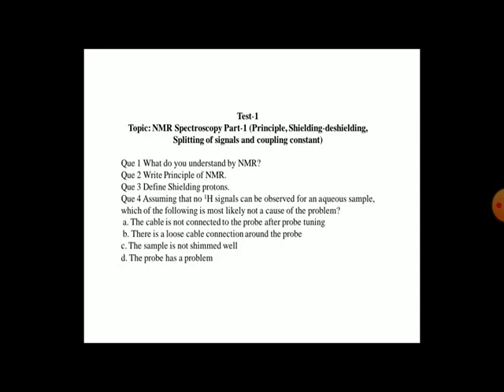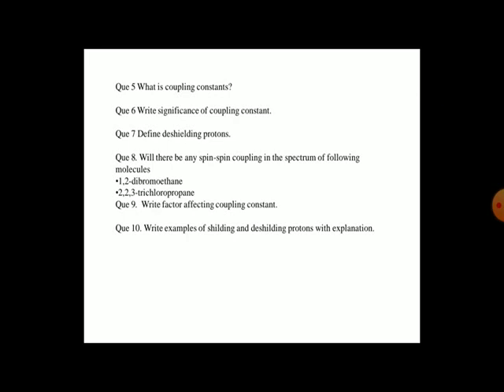Fourth question, assuming that no hydrogen signals can be observed for an aqueous sample, which of the following is most likely not a cause of the problem? A, the cable is not connected to the probe after probe tuning. B, there is a loose cable connection around the probe. C, the sample is not shimmed well. D, the probe has a problem.